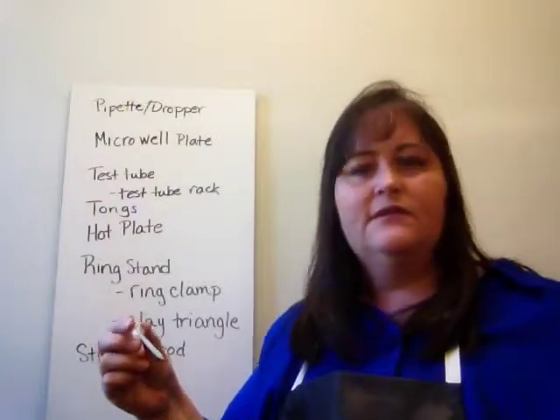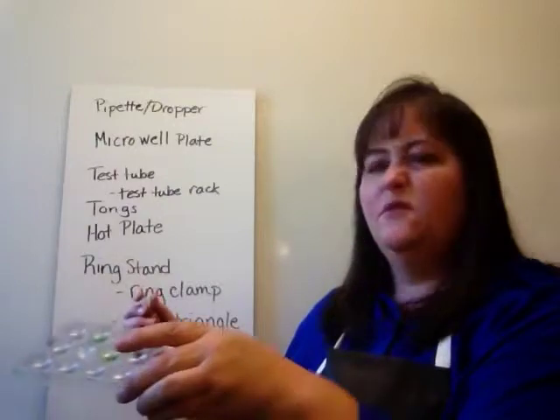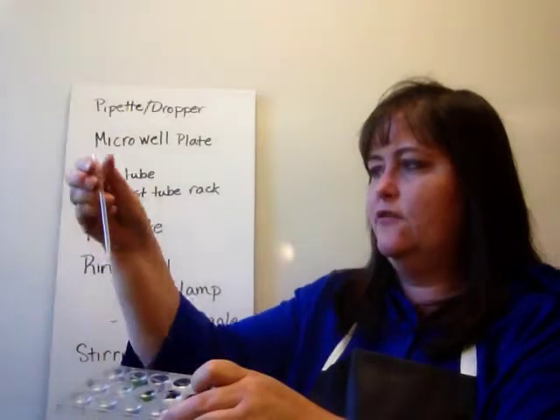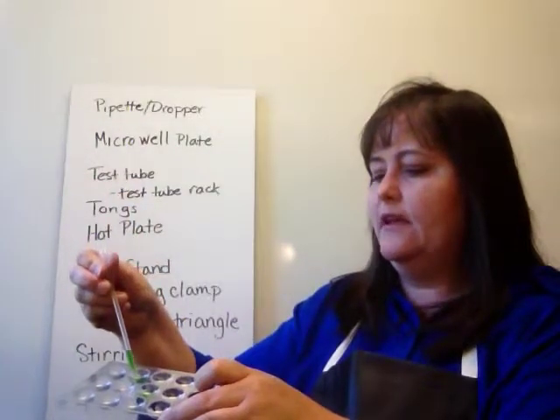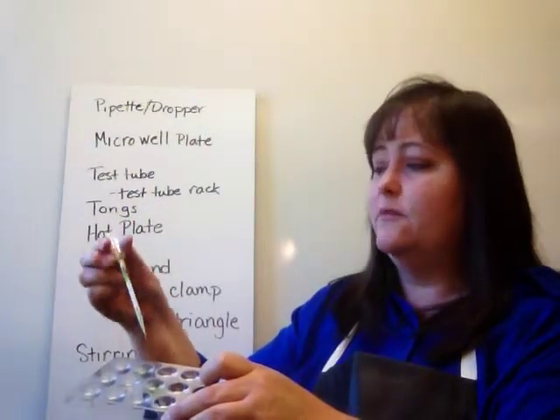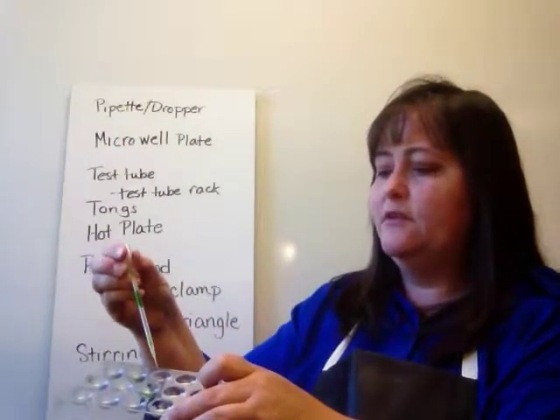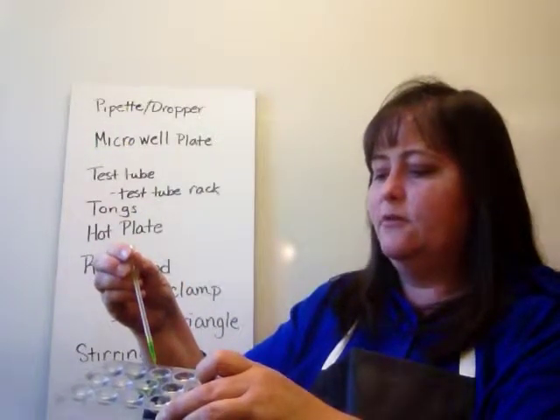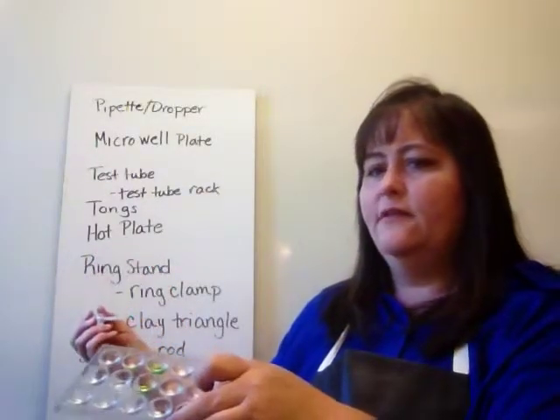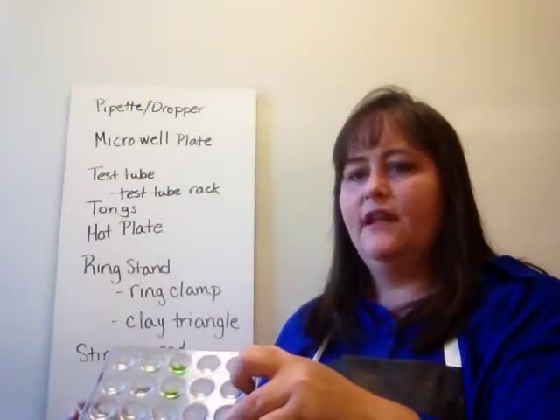One of the ways we use this is with a micro well. This is a micro well plate, and I put some food coloring and water in there just so you could see it a little bit better. If you take the dropper, put it into the micro well, and release the dropper, you're going to pull up a lot of liquid, and one of these micro well plates holds about as much as one of these can hold, a little bit less actually, and you can move it from one place to another. You can either move it to a test tube or a beaker or a flask or whatever you're using, or to another well. And you can see that now we have 3 wells that have liquid in them.